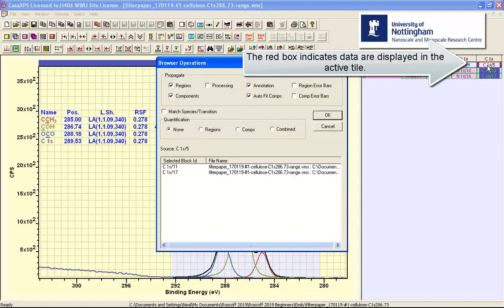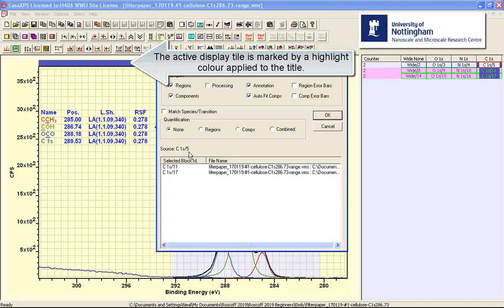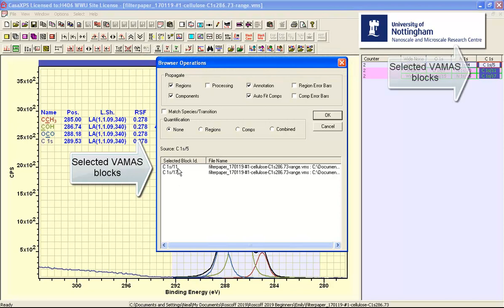We have displayed in the active tile indicated by the red box the spectrum that contained the processing. We can see it here, it's reported here as being the source of this propagation action, and then we have two selected VAMAS blocks, slash 11 and 17, and these correspond to these selected VAMAS blocks over here.